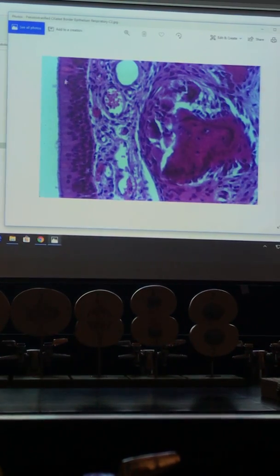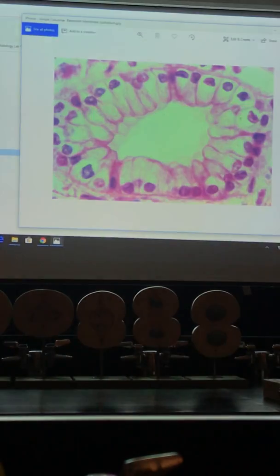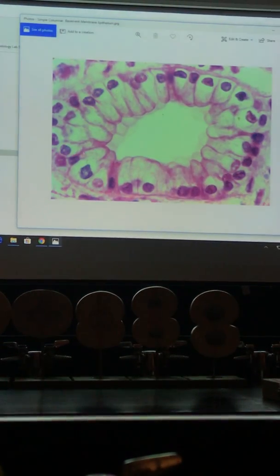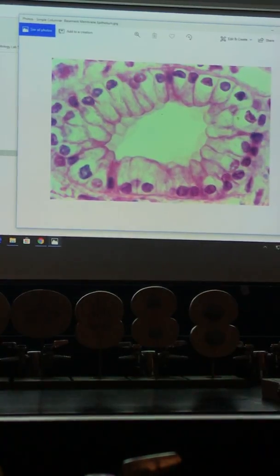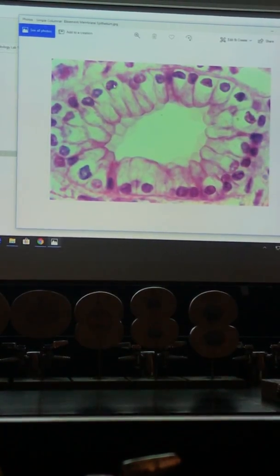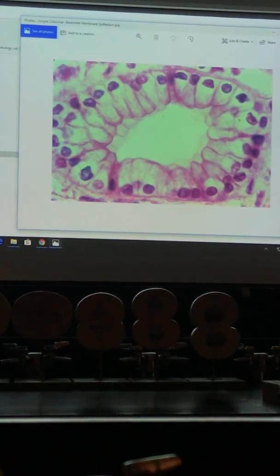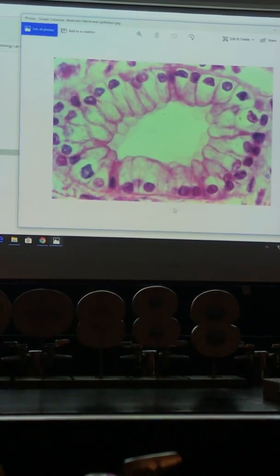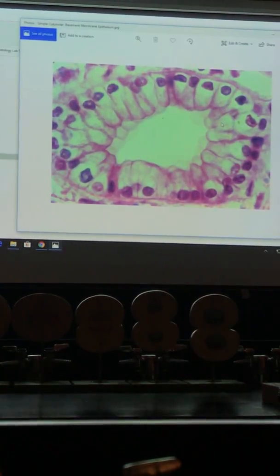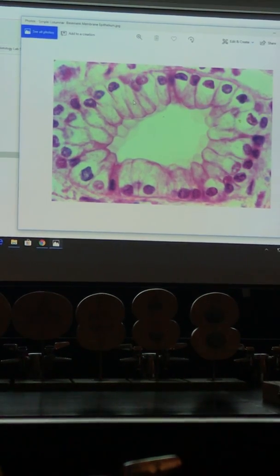See, these are longer cells, and they've got egg-shaped nuclei. This is another example of simple columnar epithelium. Columnar epithelial cells have a north and a south pole, and generally the nucleus is going to be at the south pole by the basal lamina. I'll ask you generalities. If I say, what of the 4 tissue types, what is this? What's the answer? Epithelium. Specifically, it's simple columnar epithelium.